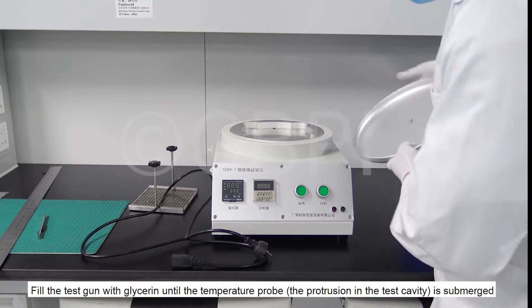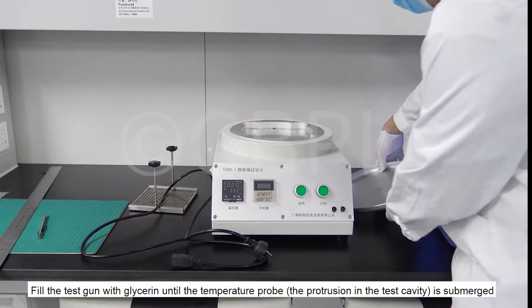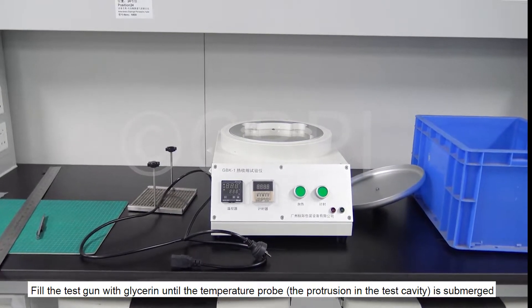Fill the test chamber with glycerin until the temperature probe — the protrusion in the test cavity — is submerged.